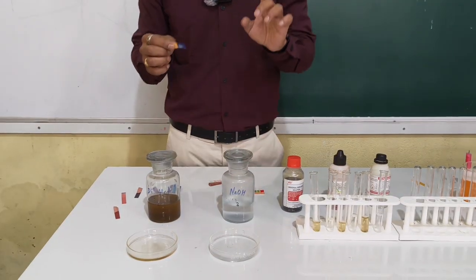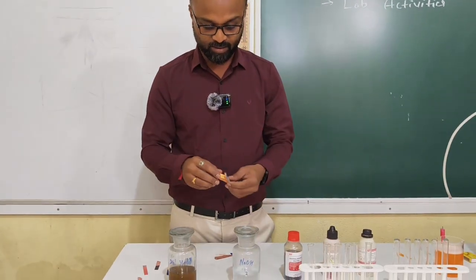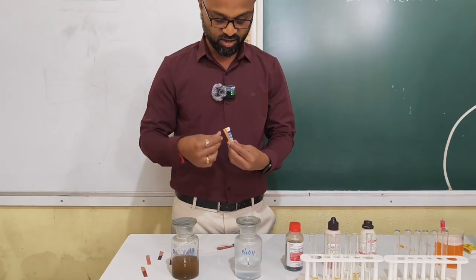Strong base. Okay. Similarly, if I take another pH paper and dip it in another solution, let us see the change in color.